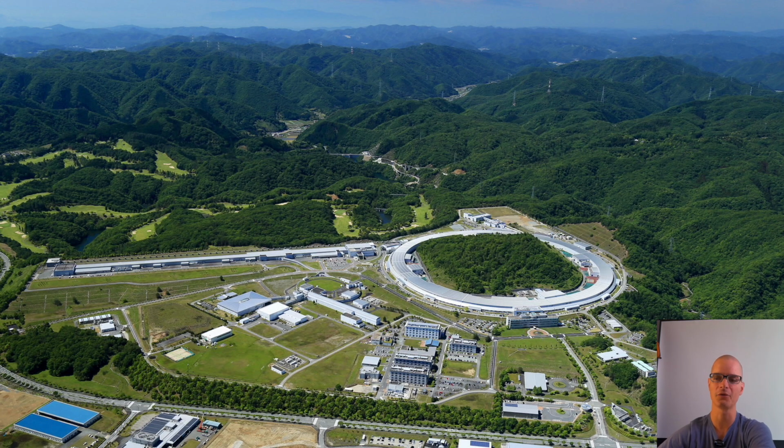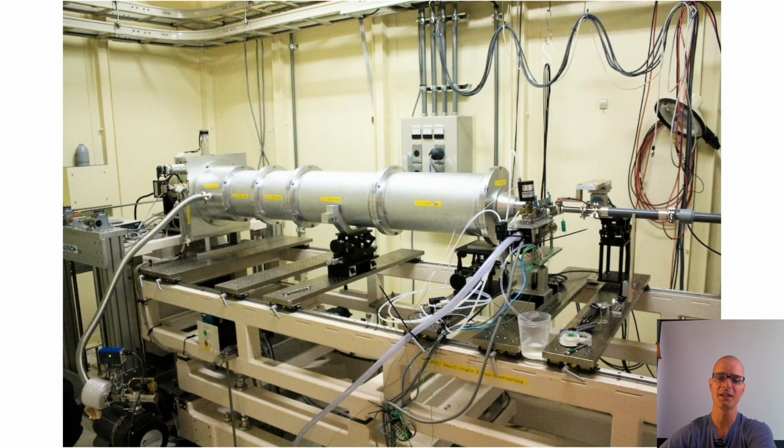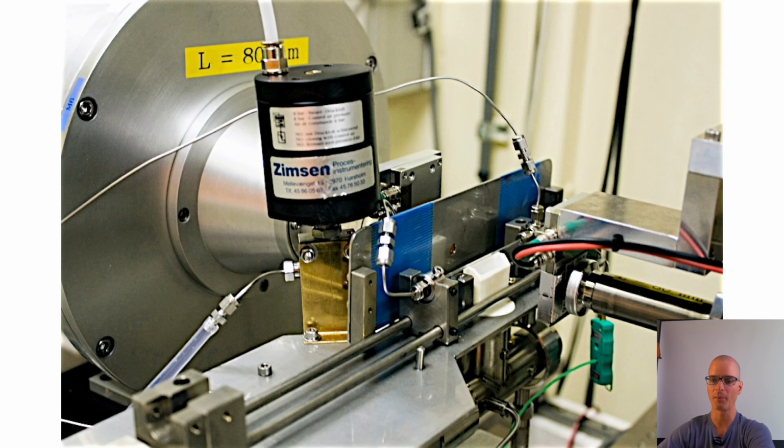It's a fascinating synchrotron. I met lots of interesting people. And over there we did experiments on hydrothermal synthesis, right? So high temperature, high pressure experiments. So we were at the small angle scattering beamline over there, where we had installed this setup so we can measure through a sapphire capillary and observe the formation of, for example, zirconia particles under hydrothermal conditions.